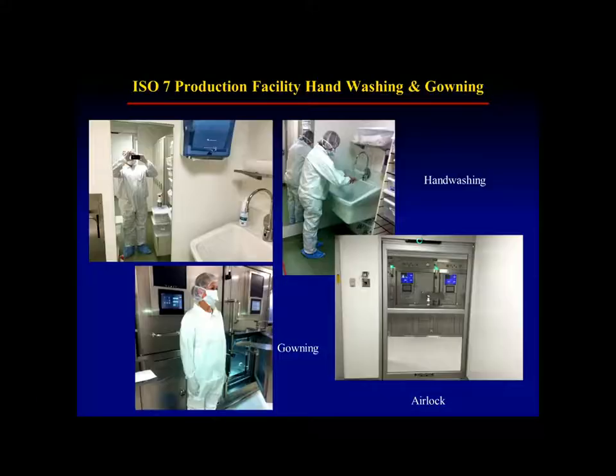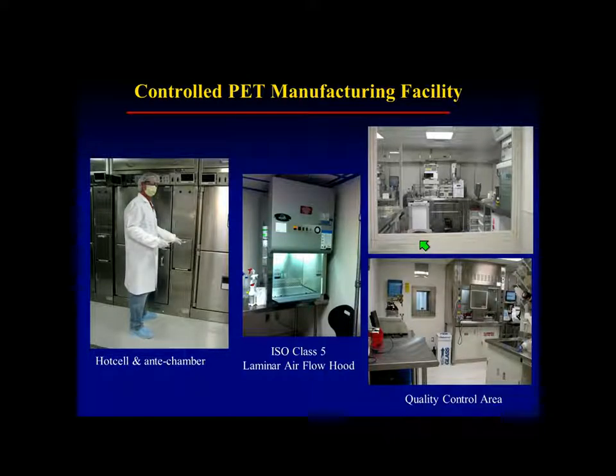This is our laminar flow hood. It's an ISO 5 laminar flow. The air flows from the top down and then out. So essentially, it's not blowing out into your face. And again, this would be the same type of hood that you'd be making chemotherapy in. In the IV room in a hospital, they have a horizontal flow that comes from the back of the hood and blows out into the preparers' faces. So if they're making up IV admixtures, they're using horizontal flow, and we use vertical.